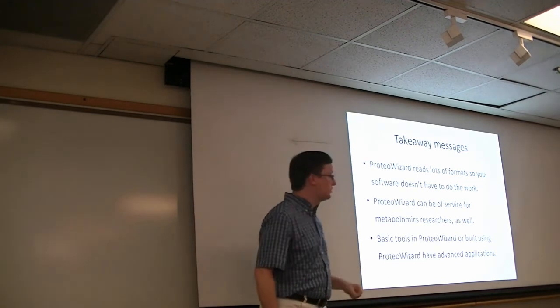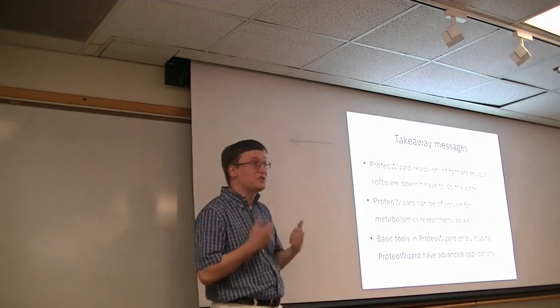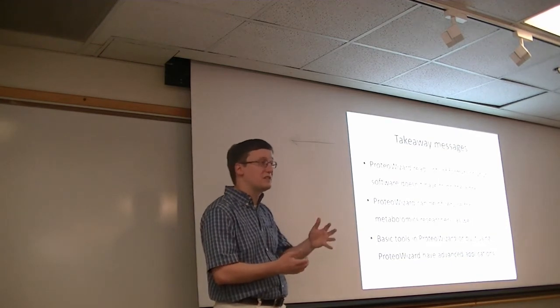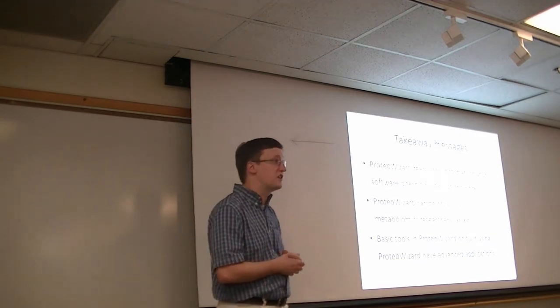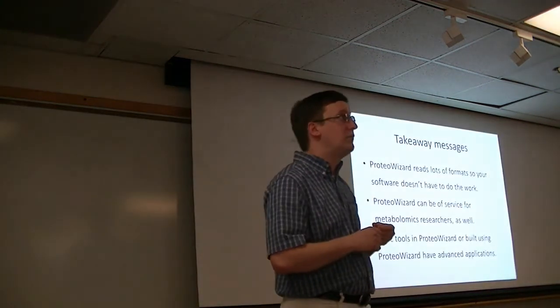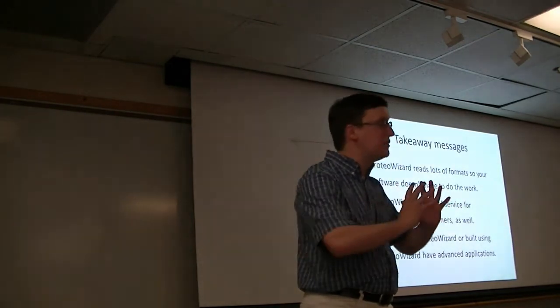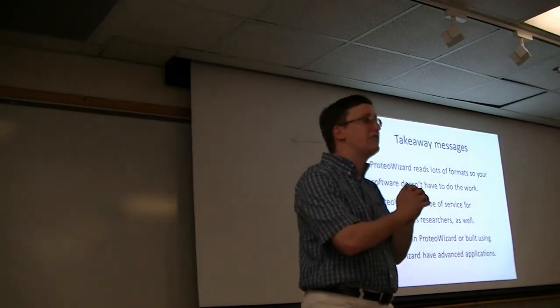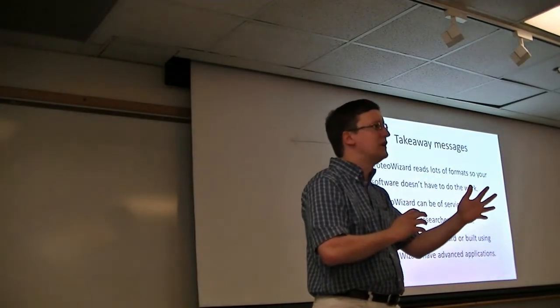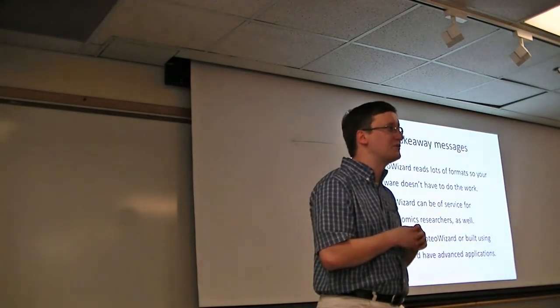So the basic tools that we have within ProteoWizard are accessible to software, but we have several that are accessible to people who are just willing to run things on the command line or with graphical user interfaces. These are fairly simple tools in general that we see distributed within ProteoWizard itself, but a lot of them give you a lot more power to take on impressive projects at your desk. So hopefully some of those will be useful to you.